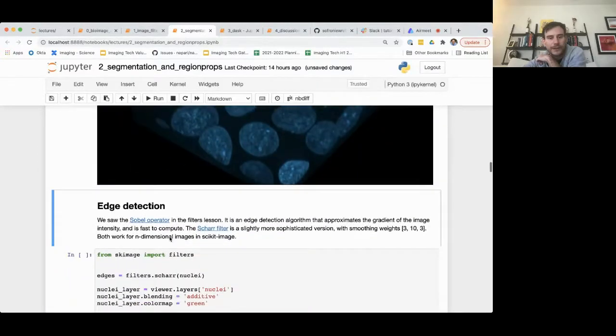All right. So let's now revisit some of the concepts that we talked about at the end of the first lecture around edge detection and the Sobel operator, and let's see what these now start to look like for real image data sets.